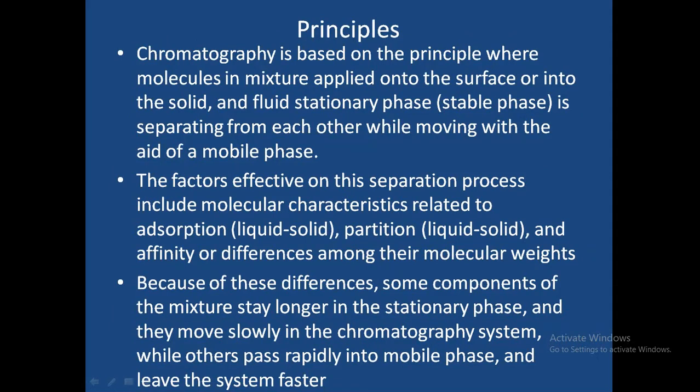Let us see the principles of the chromatographic techniques. For separating the compounds using this chromatography, we will have to understand the various principles behind the technique, and in this technique we will have to make use of 2 important phases called stationary phase and mobile phase. Stationary phase is a stable phase and the mobile phase is a moving phase. So chromatography is based on the principle where molecules in a mixture are applied onto the surface or into the solid or fluid stationary phase, separating from each other while moving with the aid of a mobile phase.